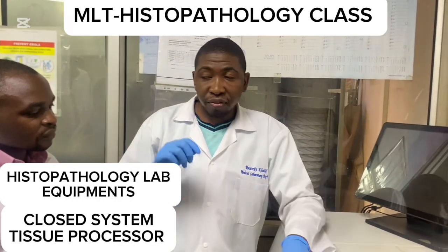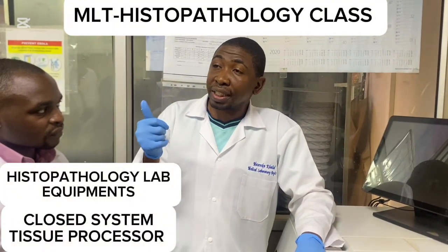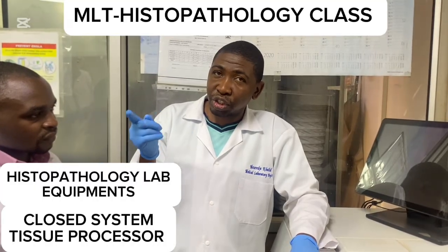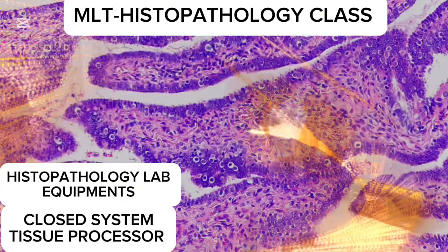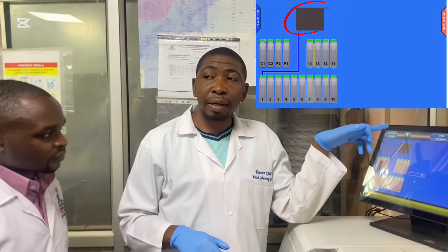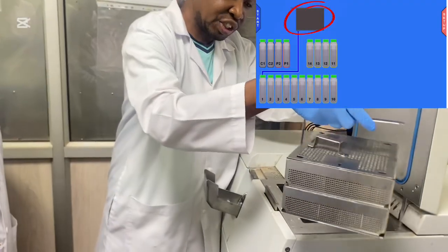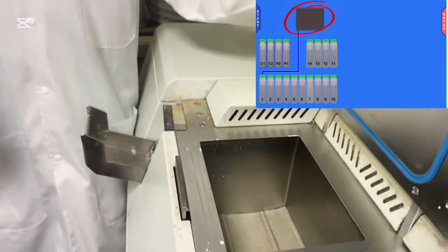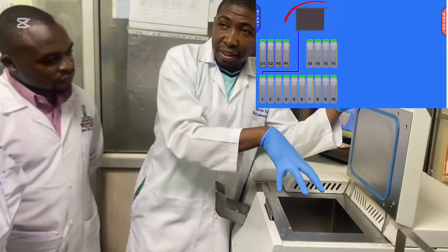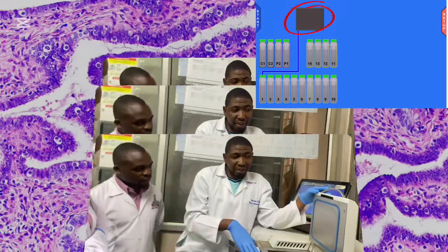Number one, we have the closed system type of tissue processor, or we call it the fluid transfer or vacuum system type of tissue processor. It has the SPC, the specimen processing chamber. The specimen processing chamber is in here. You can all come and look through. That's where we place our specimens so that the fluids can access the specimen.